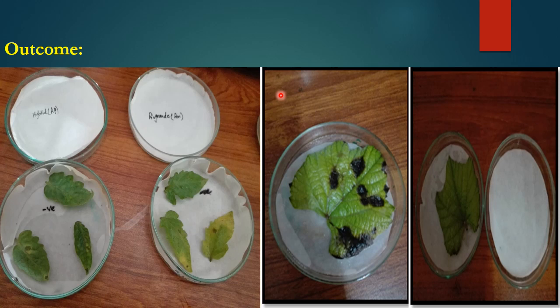Plant pathologists always advise that along with the leaf detach method, the experiment should also be done on the whole plant, and the results of both the leaf detach method and the whole-plant inoculation must be compared.